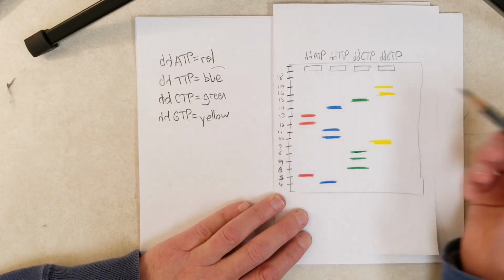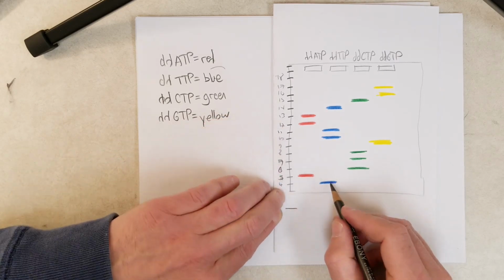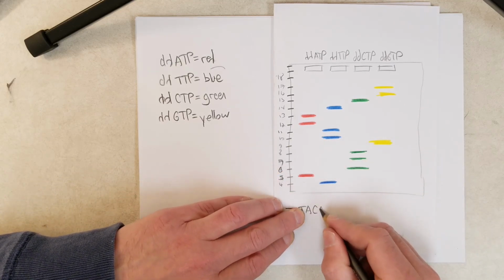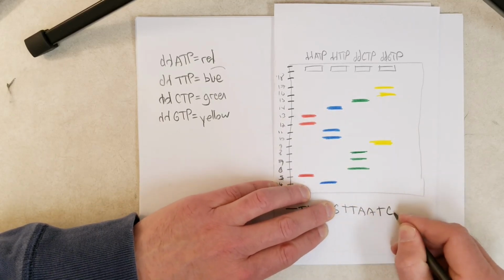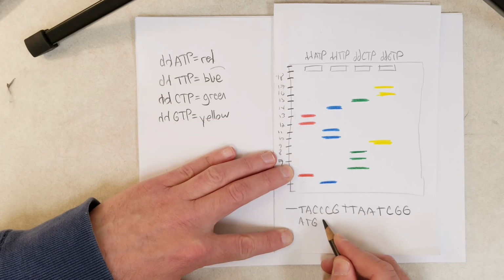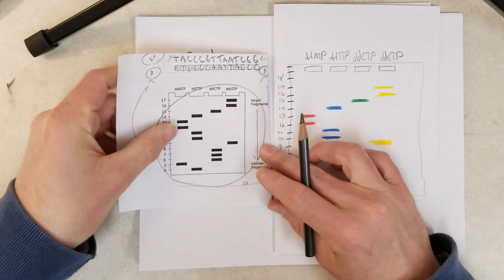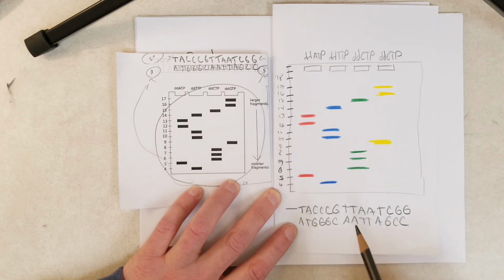And how would you read the sequence? Well, you read it the same way, right? Okay, so it starts with a primer. Now, let's say we don't even know how long the primer is, but we start with a T, A, then we're still going up by size, right? Going from shortest molecule to longest molecule. 3 C's, a G, 2 T's, 2 A's, a T, a C, 2 G's. Okay, and that would be the non-template strand, and then you determine the template. Okay, everything's great. It's easy, and it's pretty too, right? Better than these dark black rectangles. And we get the same sequence. That's a no-brainer, right? Okay, that makes sense.